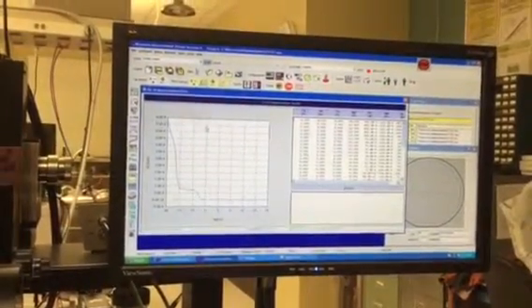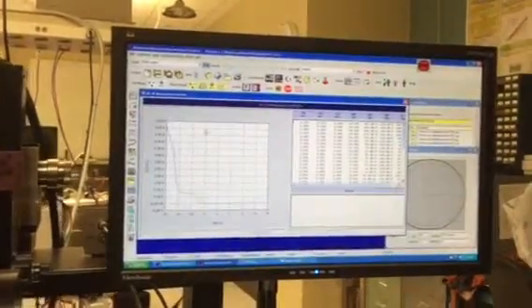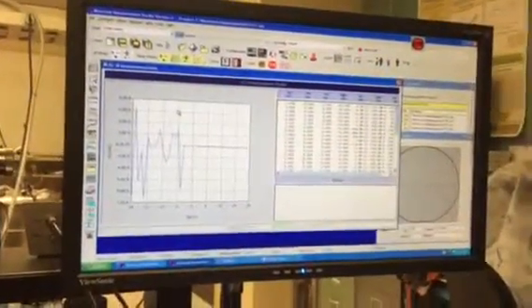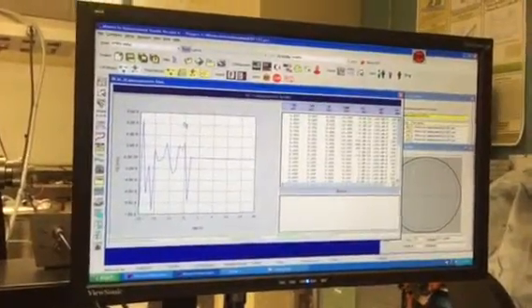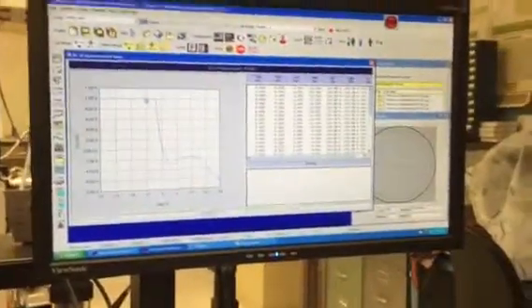So if you wanted to improve the speed of this measurement, the thing you would do is go back into those auto settings and take it out of auto and begin to set the appropriate levels of auto ranging, based on what you expect. I need to get you that paper that describes that at some point.